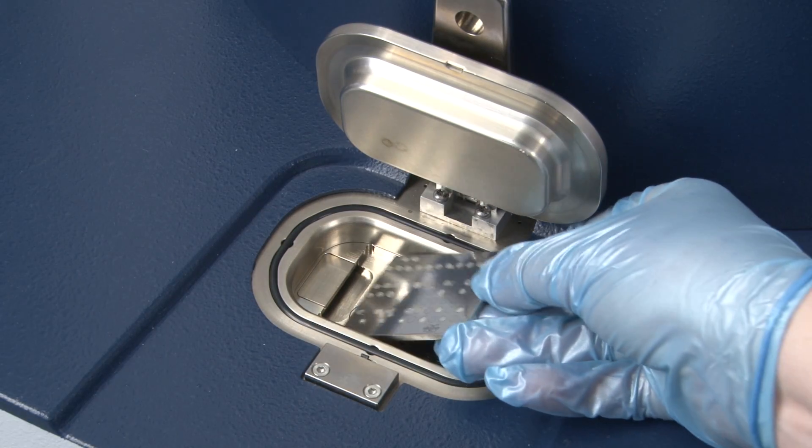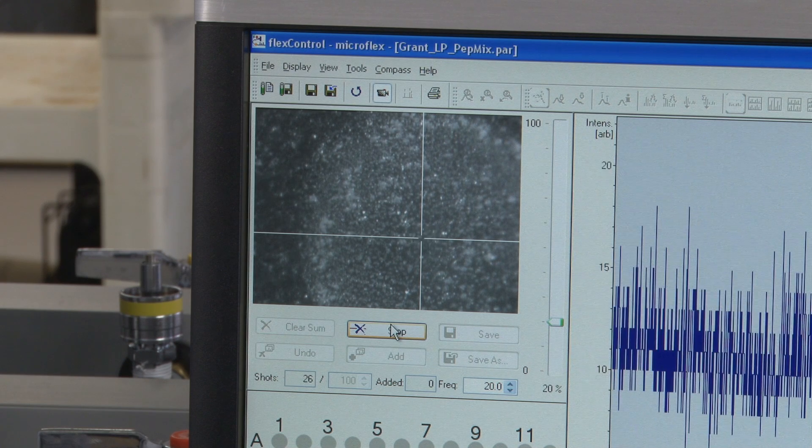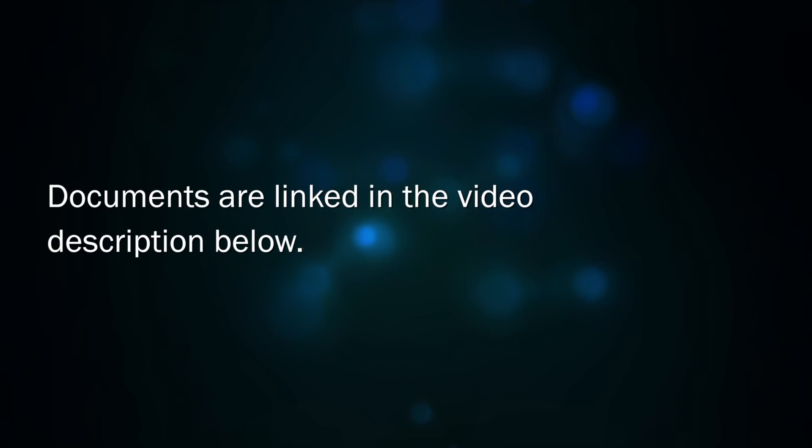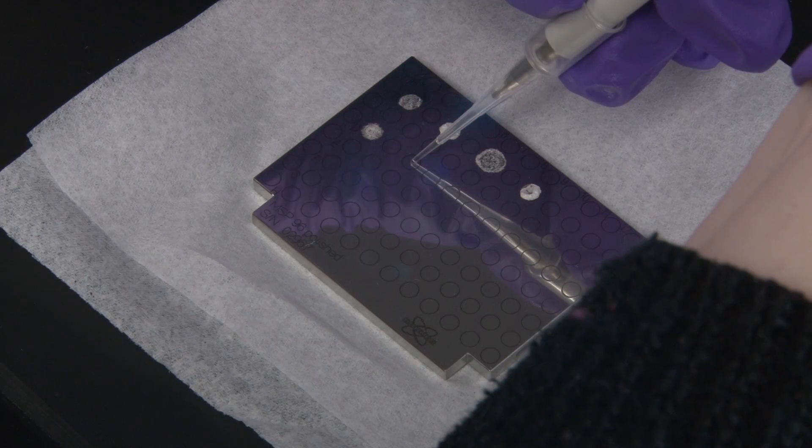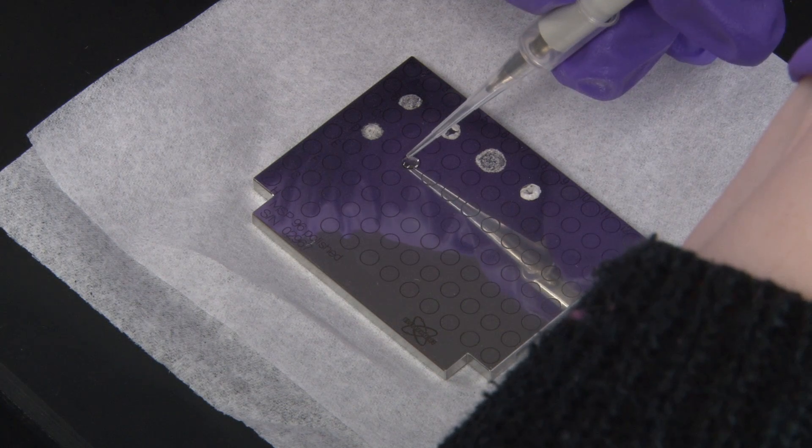As MALDI-TOF becomes an increasingly widespread method, the collective knowledge for best results will grow. Some helpful documents are linked in the video description below. Ultimately though, every sample will require experimentation to find the optimal conditions.